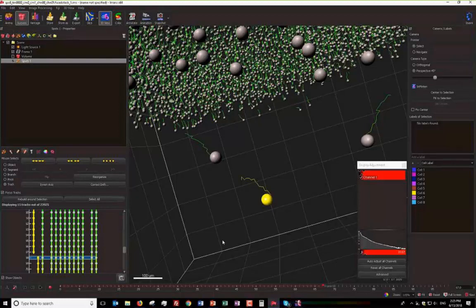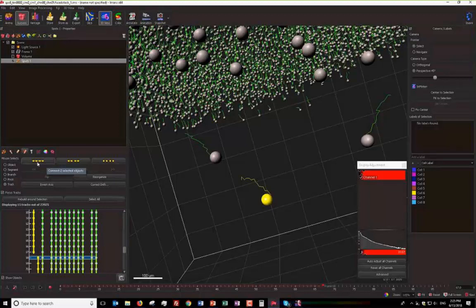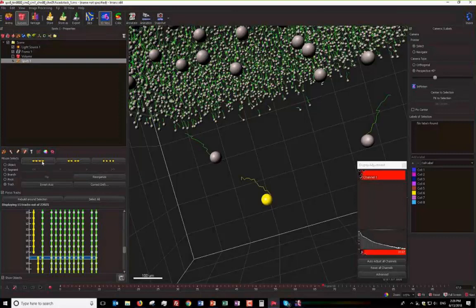This is the second change within the track edit tab. Previously we had two buttons — connect and disconnect — and now we have three. The connect button now has a graphic to describe what's happening, and also the interaction has changed. It's now much easier to select two tracks and connect them, or select a series of points and connect them through time into one single track. I'll go ahead and do that now, and we'll see the connection update in a second.